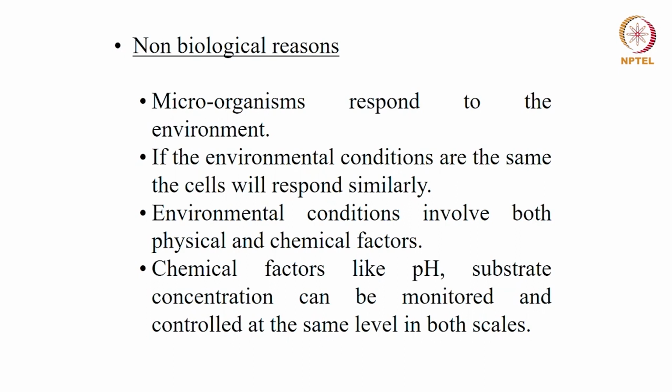Then there are non-biological reasons. Microorganisms respond to the environment. If the environmental conditions are the same, the cells will respond similarly. Now, this environmental condition can be both physical and chemical. Chemical factors like pH or substrate concentration can be monitored and controlled at the same level at both scales.